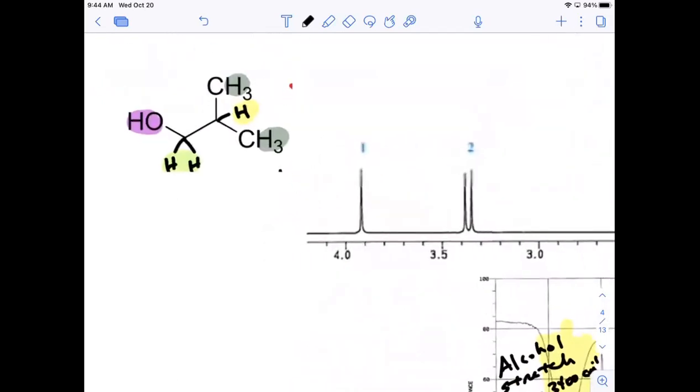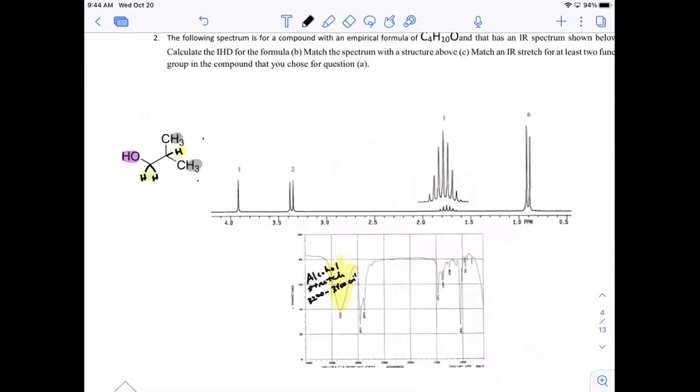And obviously let's go through all of the protons. Which one do you want to start with? The purple. Okay, you want to start at the OH. So the OH proton, in this case, is showing up. And remember, it's not going to couple, so regardless of what N is for that, it doesn't follow the N+1 rule.